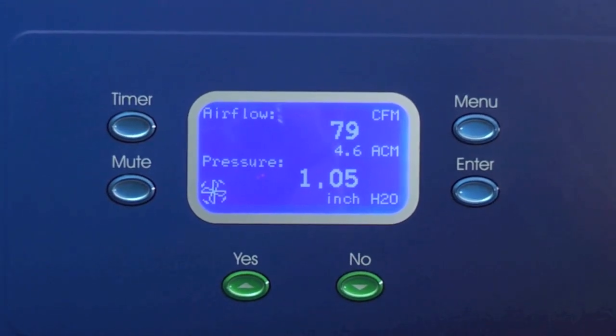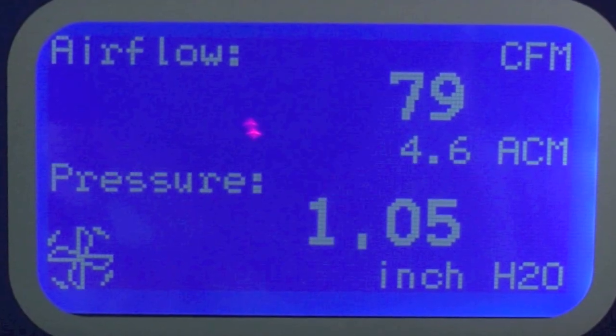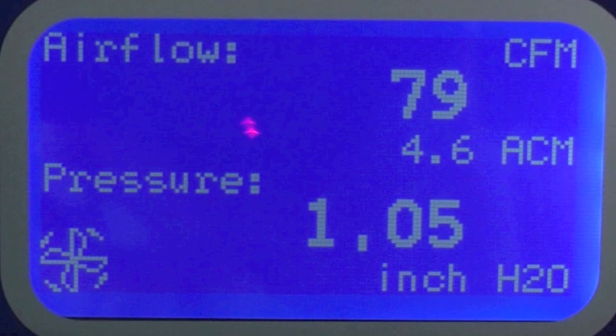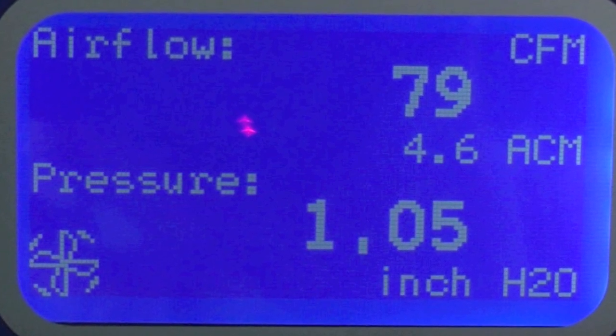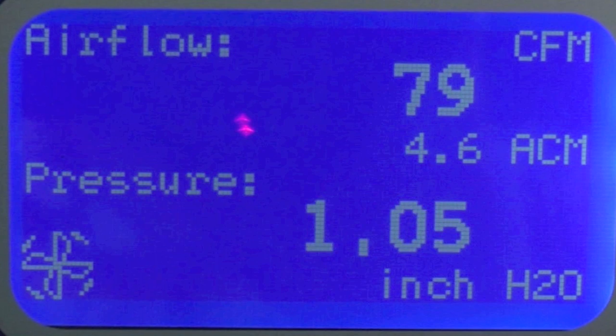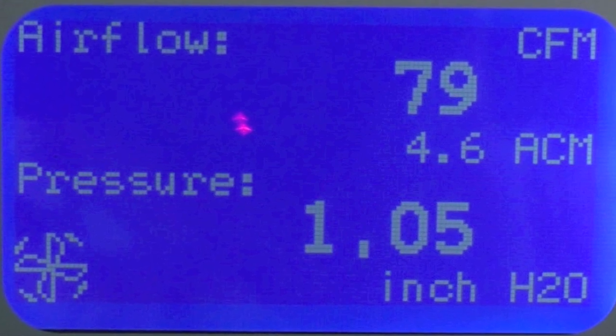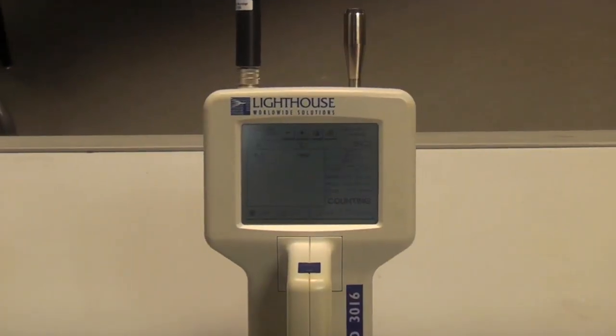The display monitors the air volume dilution rate in cubic feet per minute, the air total changes per minute of the glove box internal volume, and the main chamber static pressure in inches of water column pressure.